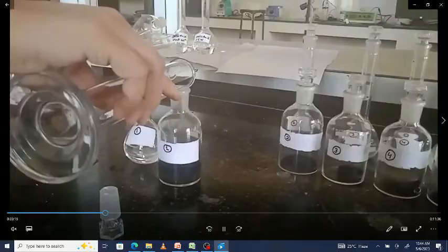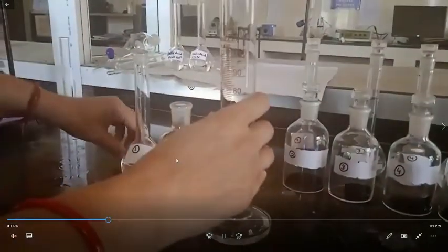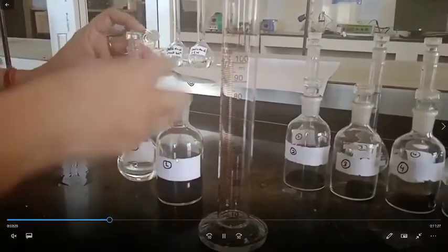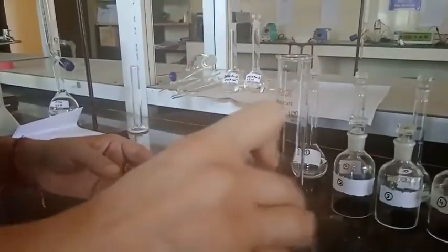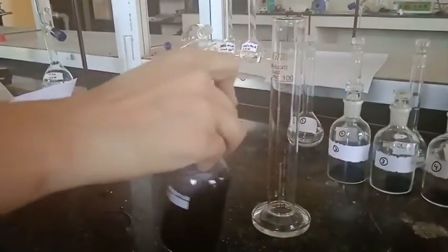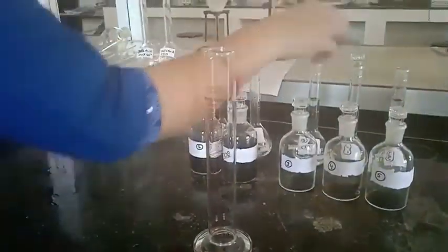So this is called before adsorption, and this is called after adsorption, after leaving it for half an hour. So you get what I am saying? So this is after adsorption in the reagent bottle. After half an hour we will filter it. Similarly we do for the other bottles too.